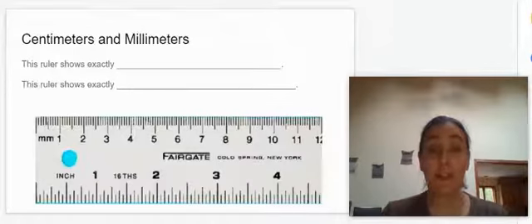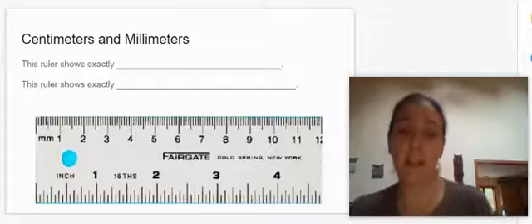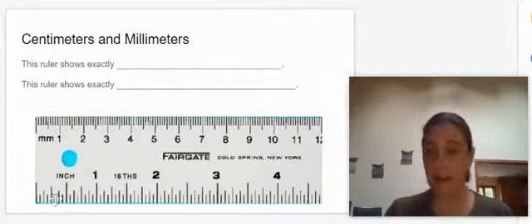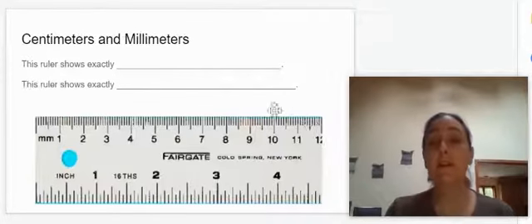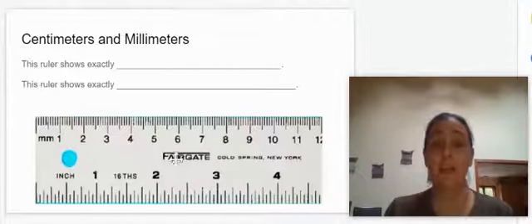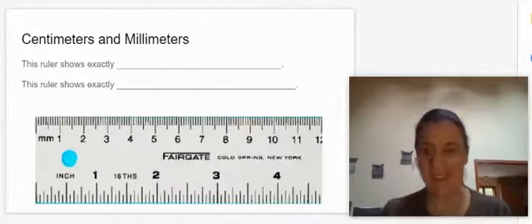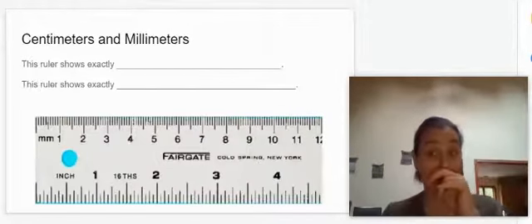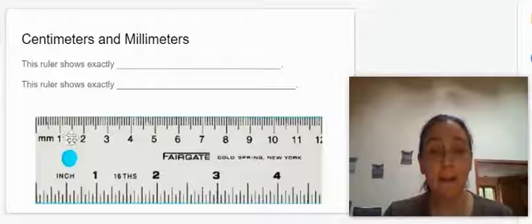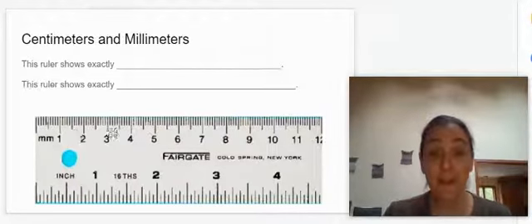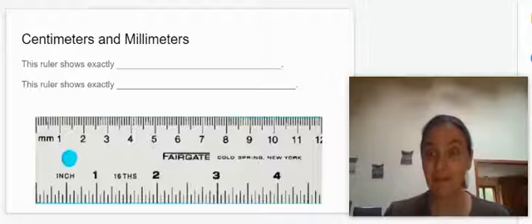So let's look at that metric side up close. So here's an up close look at it. You can see down here are the inches that we will not use. And up here are the millimeters. It's labeled millimeters side. That's the metric side that we'll be using. Now, this is really misleading. This ruler stinks because it says mm, which means millimeters. But the numbers aren't millimeters at all. The numbers are centimeters.